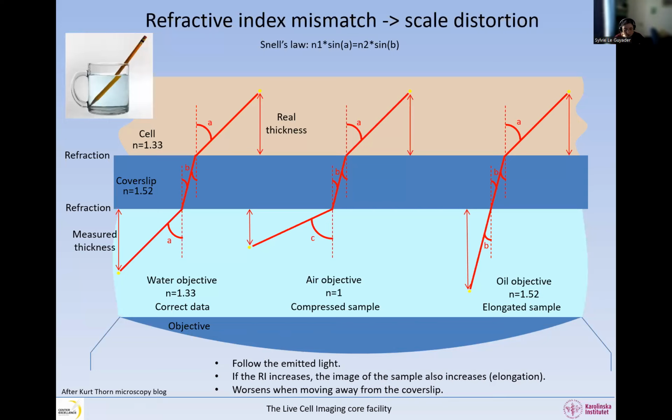But when you are using RNAscope in a section and you put it on the slide with a thick layer of mounting medium, and you image with the wrong objective, this is really difficult to analyze, because from one day to another, you're going to have more or less mounting medium, and this will influence the brightness and the shape and the contrast of your images.